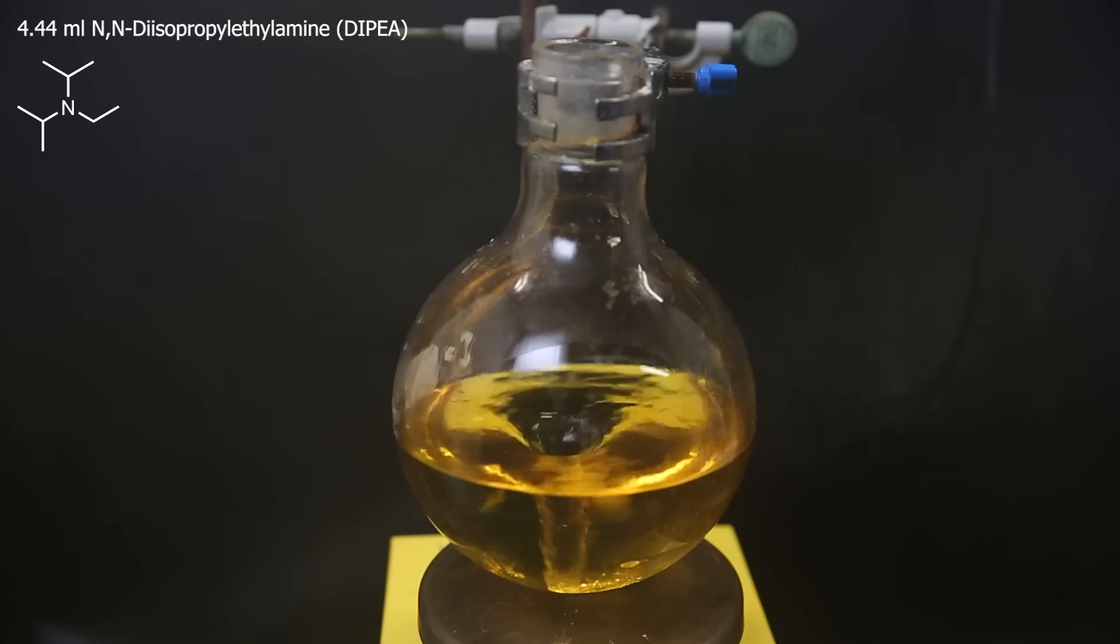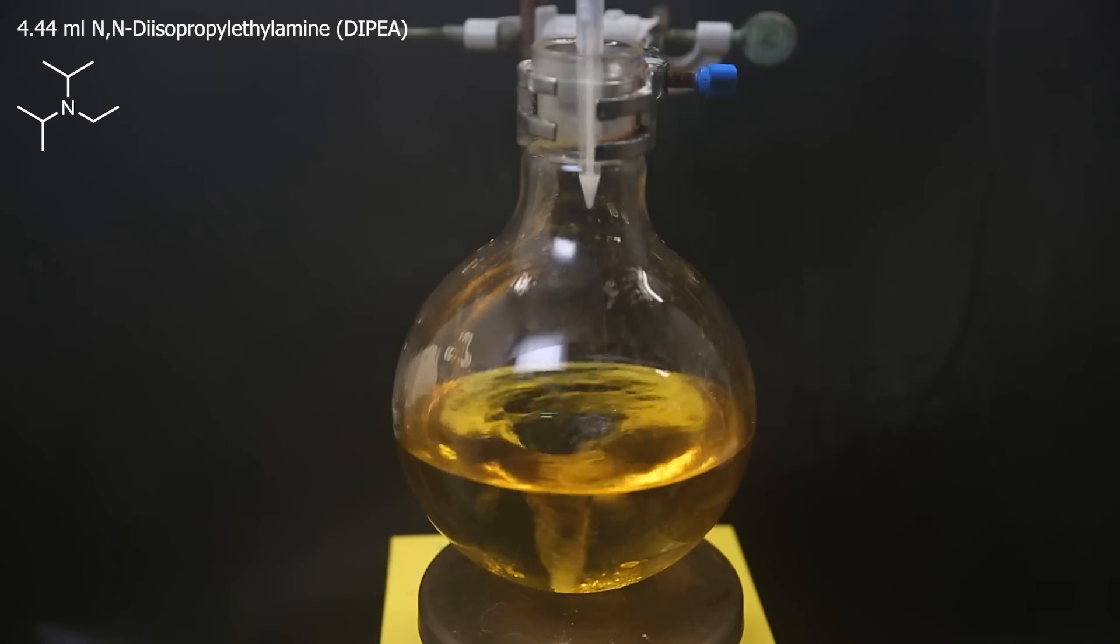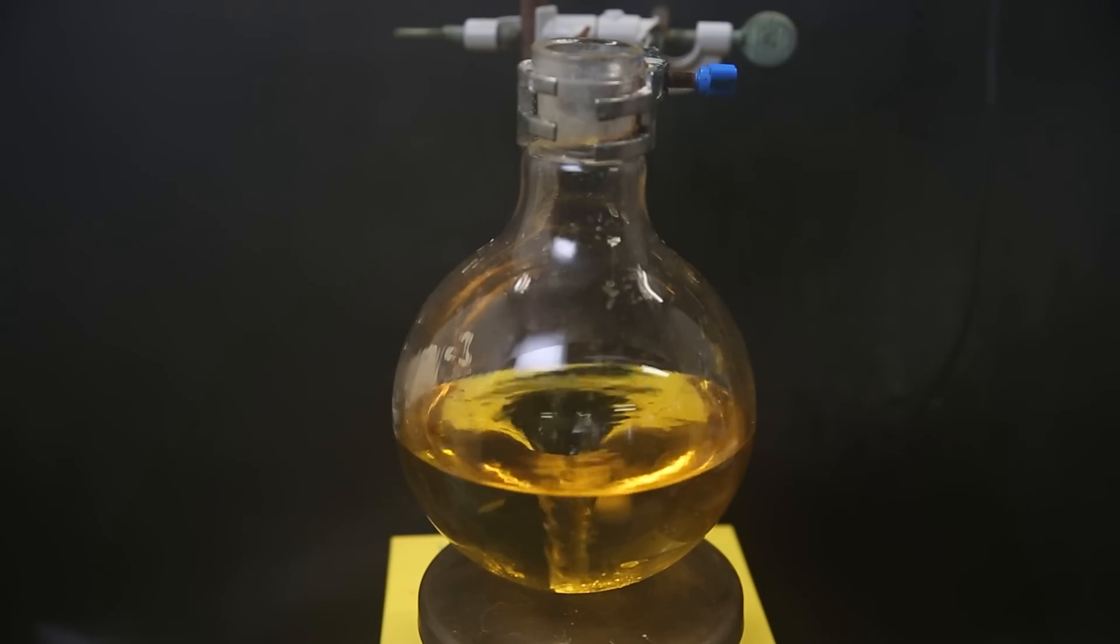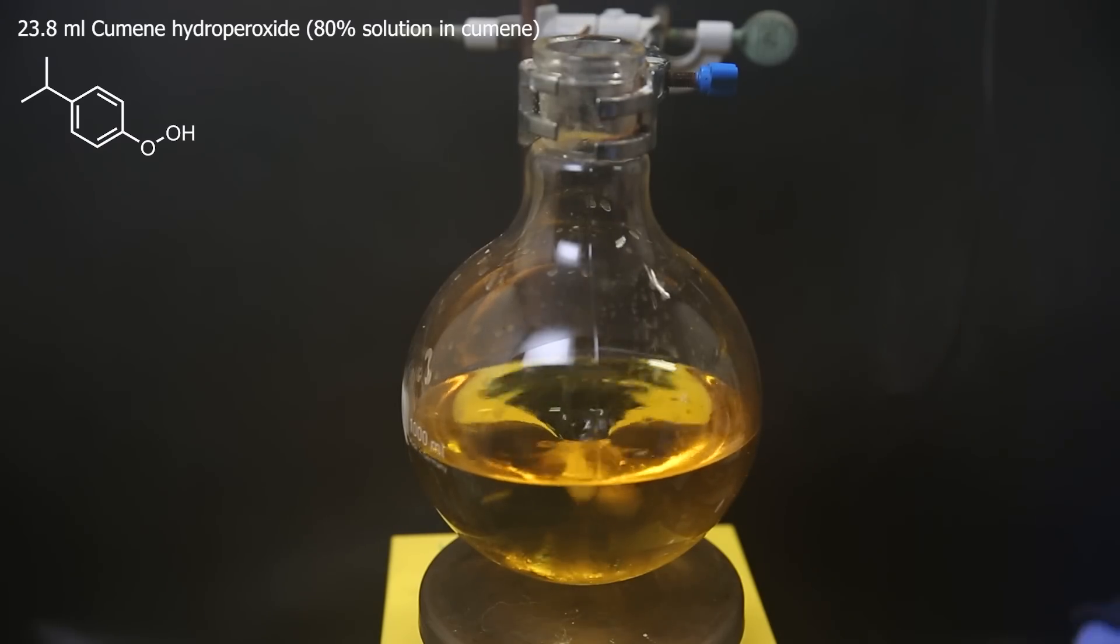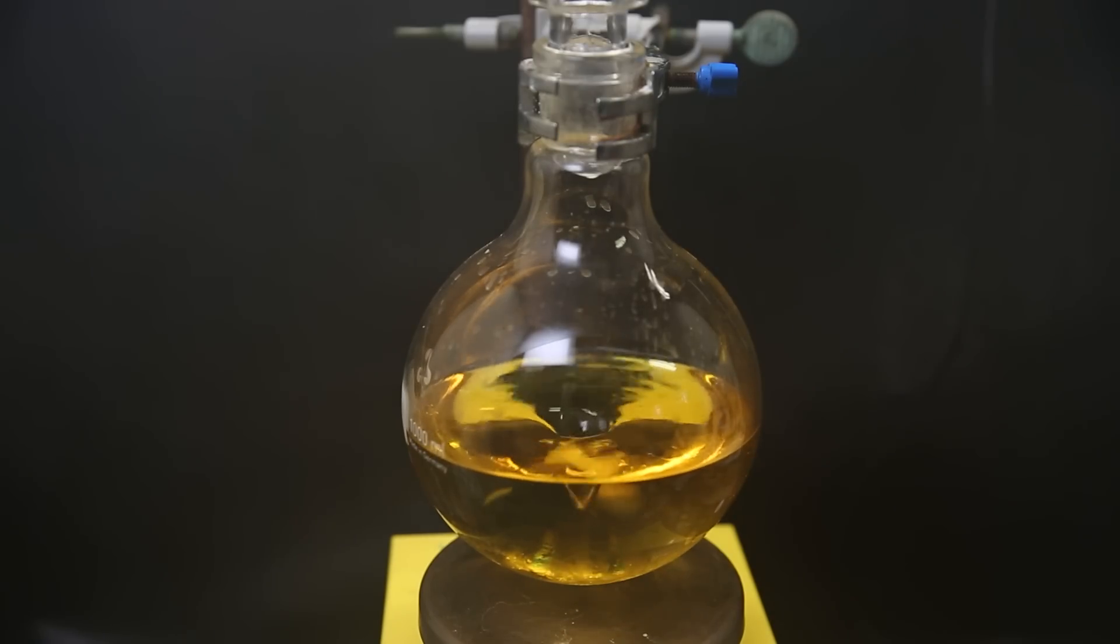After cooling to room temperature, I add in 4.44 mls of DIPEA as a base and let it stir for another 10 minutes. The catalyst is now completely ready, which means I can add the oxidizer, so I slowly add 23.8 mls of the oxidizer cumene hydroperoxide. When that's done, I leave it to stir at room temperature for 20 hours.